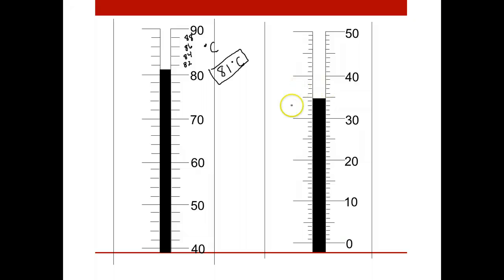All right, the first thing we're going to do here is identify what our markings are. We have 30 and 40. Again, these are all in degrees Celsius. So then we have 10 tick marks in between here. So you automatically know this one's going to be more precise than this one, because there are more tick marks between the tens place. So here we have 31, 32, 33, 34, 35. You're quickly seeing why they don't number all these.